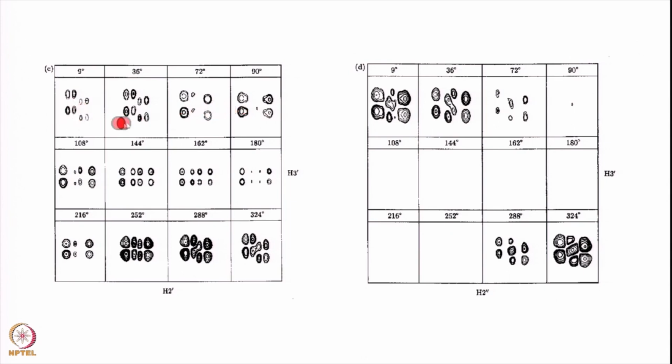For the north region of course all of these will be present, and you can see from this calculation how the pattern happens. This is in the COSY 45, and once you have that you can see how the number of components in the pattern is reduced. This resolution will allow you to estimate the coupling constants.